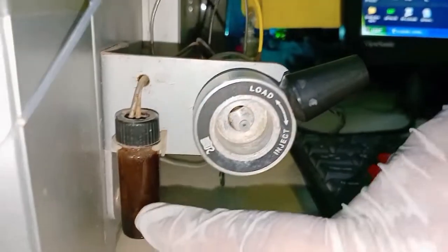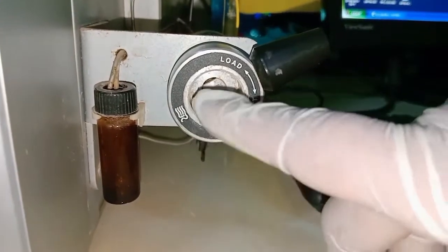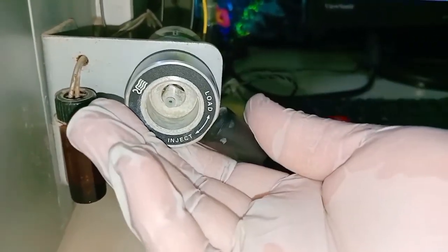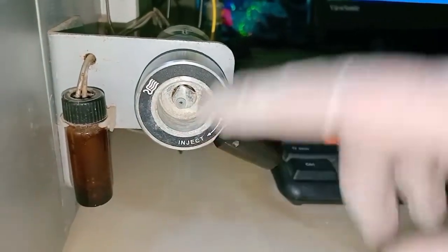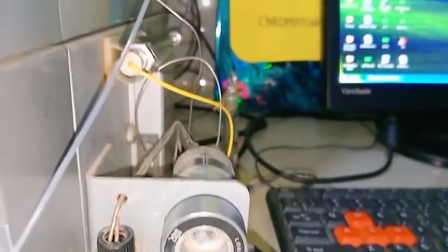Excess of the sample will come into the collector unit. After loading the sample into the injector system, we can trigger the system into the inject mode. Then the sample in the injector goes along with the mobile phase to the column.